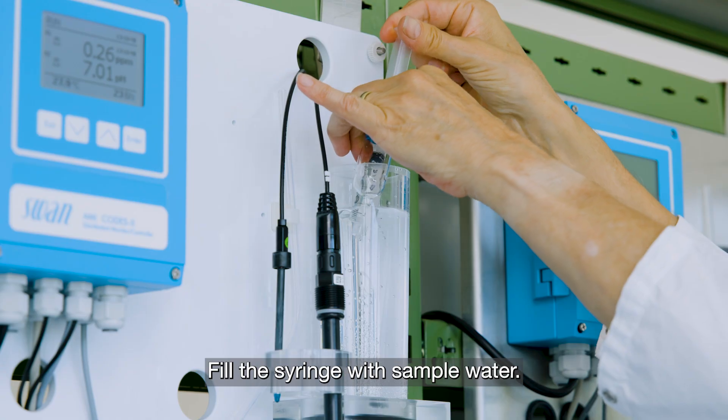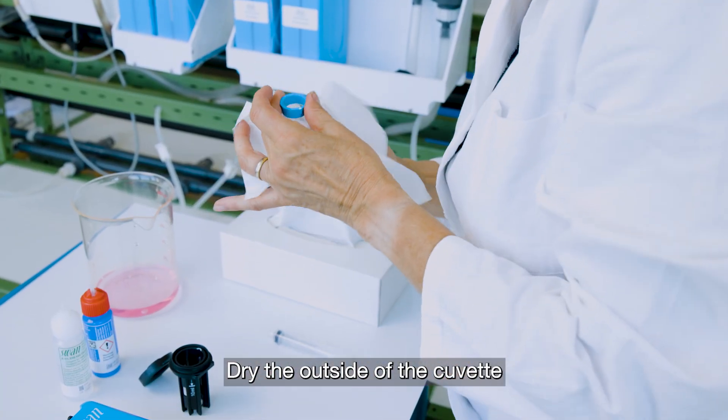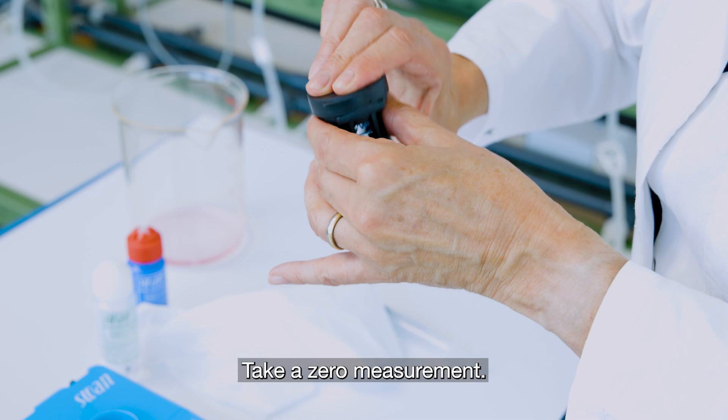Fill the syringe with sample water. Fill the cuvette. Dry the outside of the cuvette and place the cuvette in the photometer. Take a zero measurement.